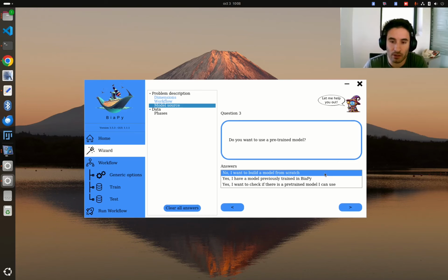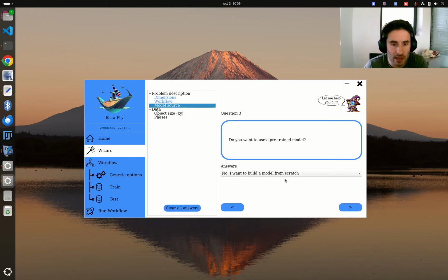We are going to have a separate video explaining just that, so it's clearer. So I'm going to select no, I just want to build one model from scratch, and all the other options are going to be covered in that video.